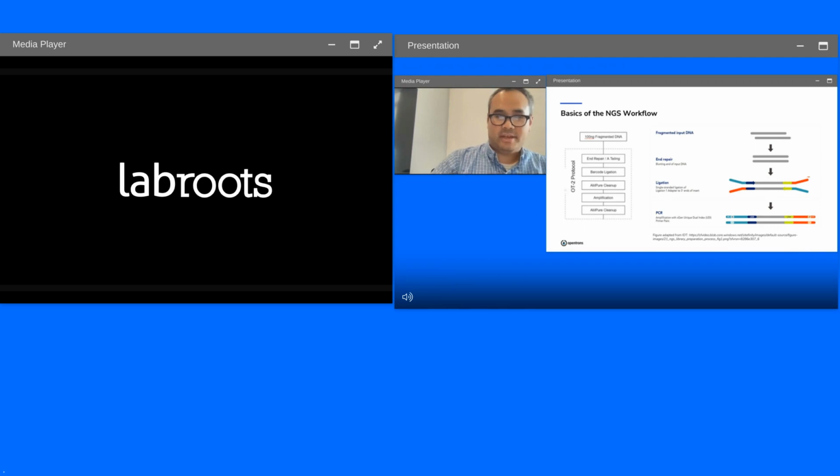As you see in the ligation, we're adding on an adapter. Usually this one contains a unique barcode. So later you're able to combine these samples together and run them on the sequencer in one batch. Well, you can multiplex multiple samples together.